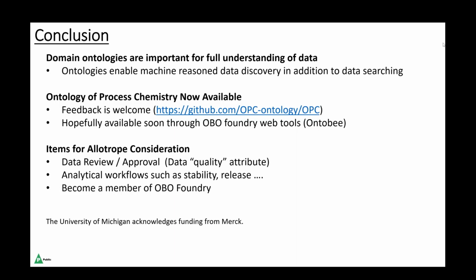And if the question was more like how the definitions are defined, we got a lot of them, if they were regulatory related, from ICH. We get a lot of them from review articles, some from textbooks, and quite a bit from Wikipedia. Frankly, there's a good section on process chemistry in Wikipedia. Okay. And I trust, Wes, that all those attributions are part of the ontology, correct? For folks who want to check.